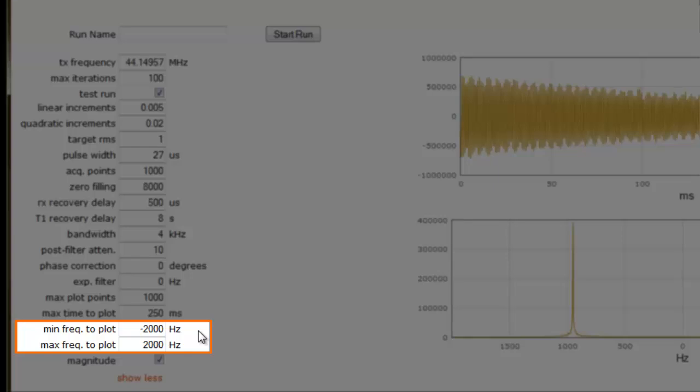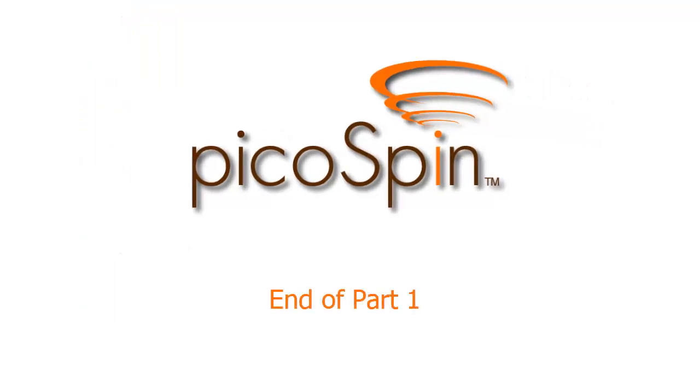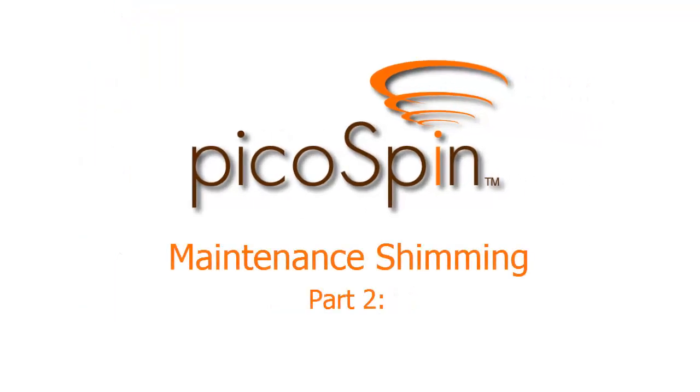We can leave the minimum and maximum frequency to plot set to minus 2000 and plus 2000 Hz. We'll adjust these values later, but for now let's leave them set to the maximum frequency range for this bandwidth. Now that we're familiar with all the parameters needed for shimming, we can move on to part 2 of this video which describes running the AutoShim script. So let's get started with shimming.